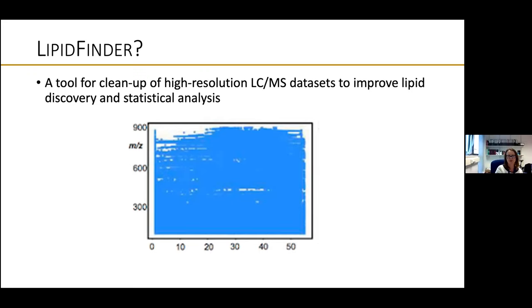we acquired a high resolution instrument like many people were doing around 2014, and we ran a long chromatography run. This is a typical example of a data set we would have got at that time. 50 minute reverse phase HPLC run, 100 to 900 mass units. And if you're doing 3 scans a second on an Orbitrap at high resolution, this is the kind of thing you get, maybe 60,000 features showing up. And the majority, about 90-95% of this is junk, and you just have to clean it up.